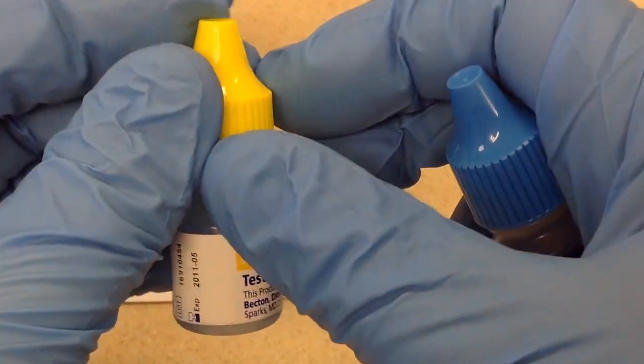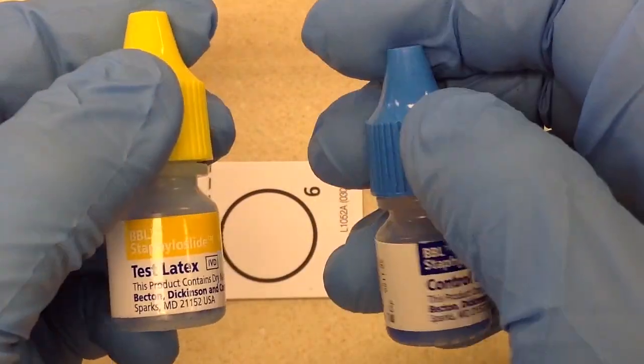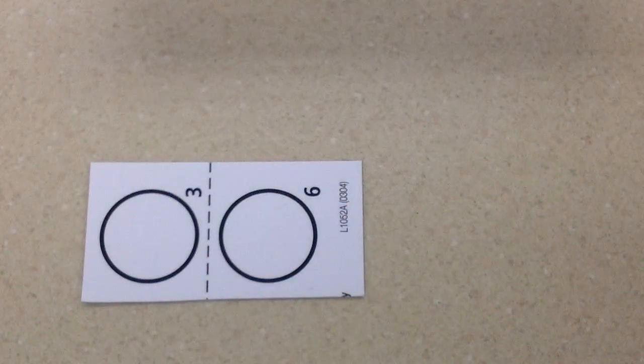If we were running quality control, we'd be doing a positive, which is Staph aureus, and a negative, which is Staph epidermidis. But we're going to go ahead and run this as if we were running a patient.